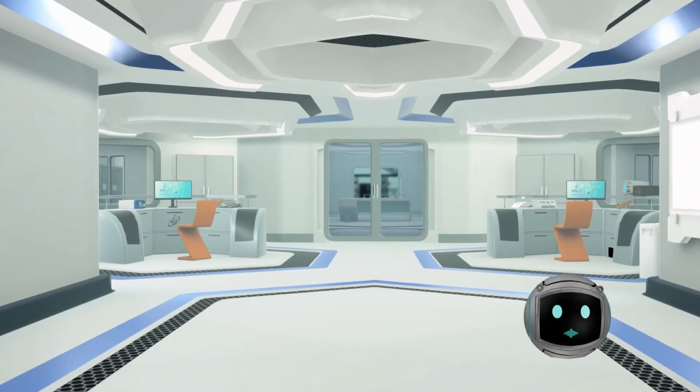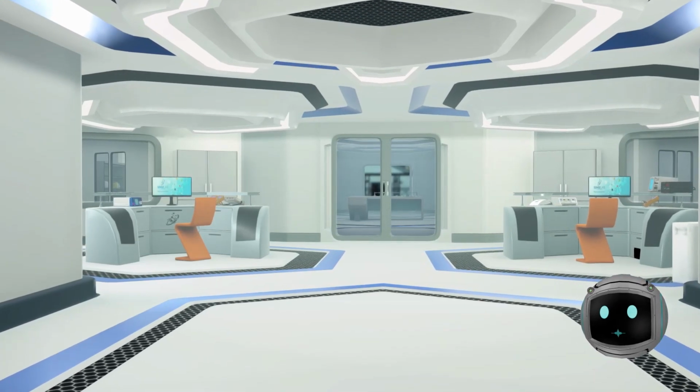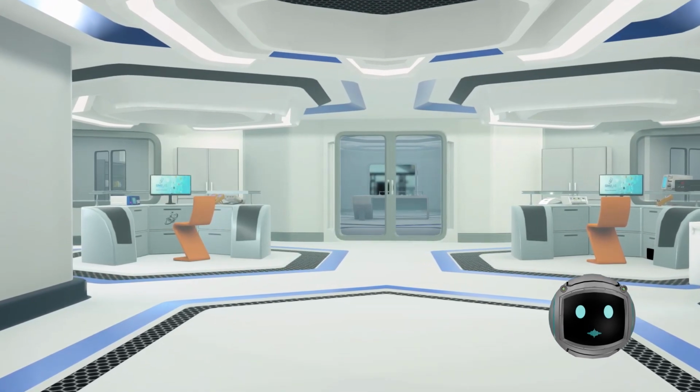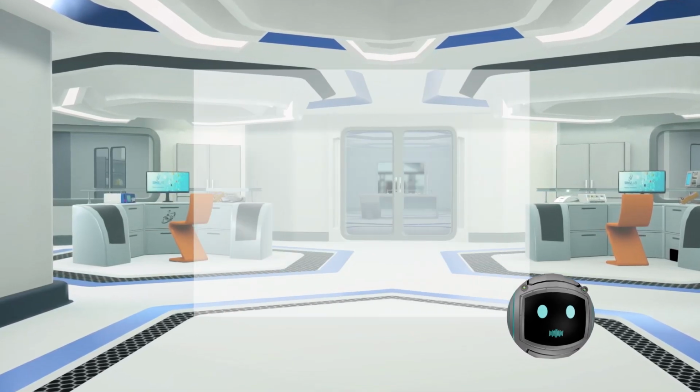I am Sophia, the lab assistant. I will be assisting you all the time for your entire experiment simulation. The guiding instructions from me help you to complete the experiment.